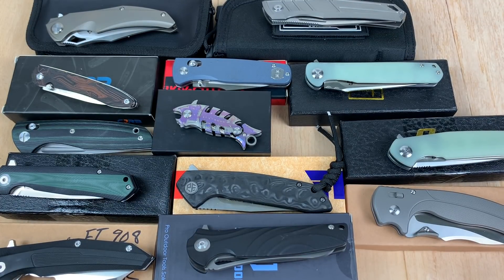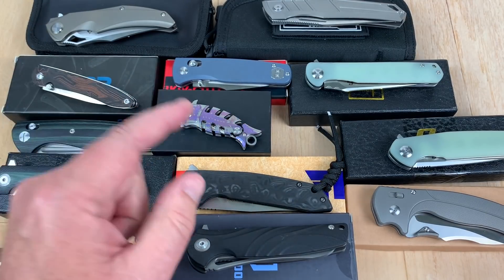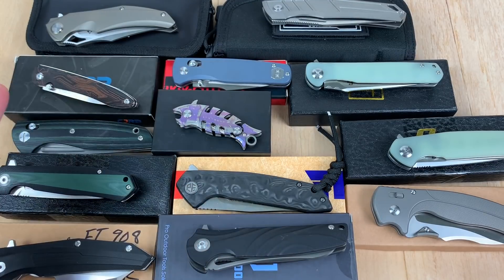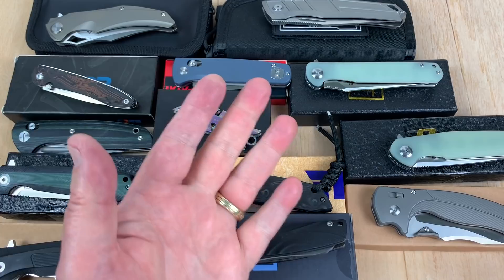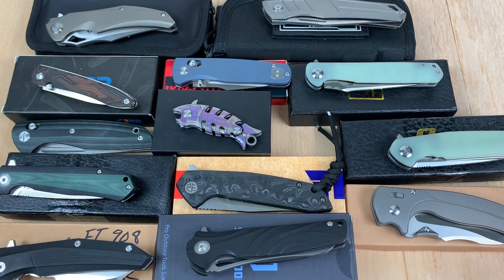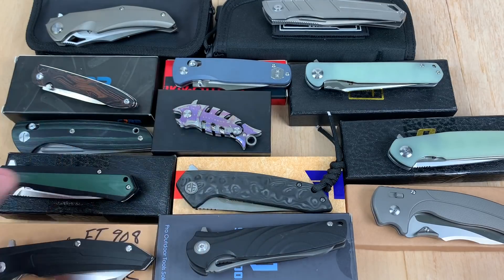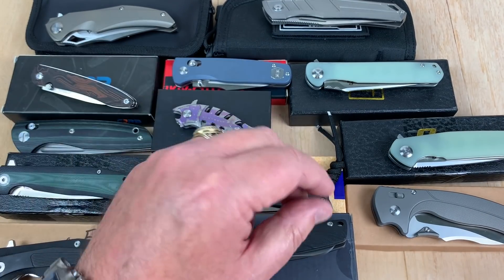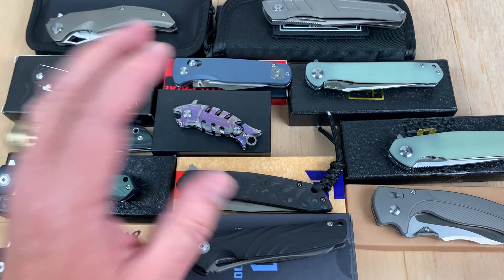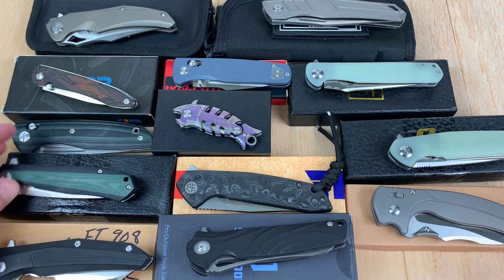We're gonna batch you out with batch 41. We're gonna find the liars and the truth-tellers alike when we get the XRF analyzer gun — you can also call it the PMI gun — pointing at them. This is a group of 13 knives, lucky 13. I've got another batch already ready to be reported on and another batch sent in for testing, so as long as I can latch on to a metallurgy guy with the gun, we're gonna keep going.